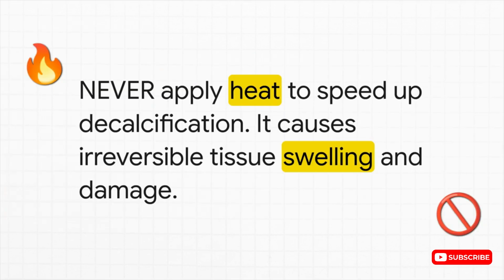Okay, I absolutely cannot say this enough. Never, ever apply heat to speed up decalcification. It might seem tempting, like a quick shortcut, but the acid reaction will just go wild. You will literally cook and digest your tissue. It causes irreversible swelling and maceration, and it completely destroys the morphology. There is no coming back from that kind of damage.